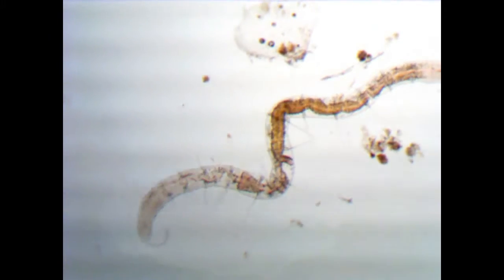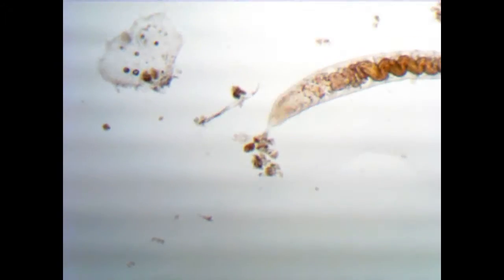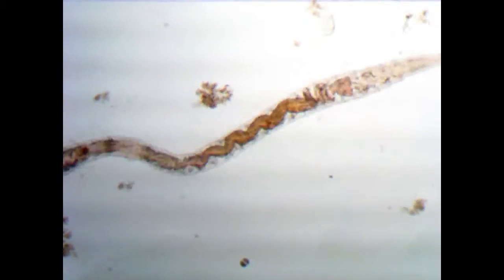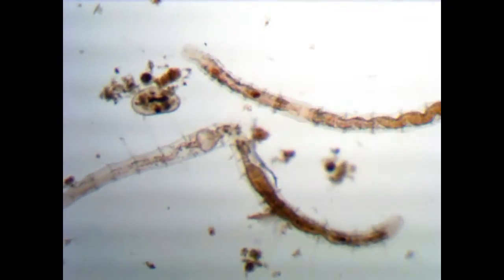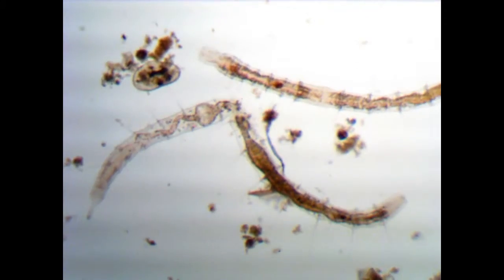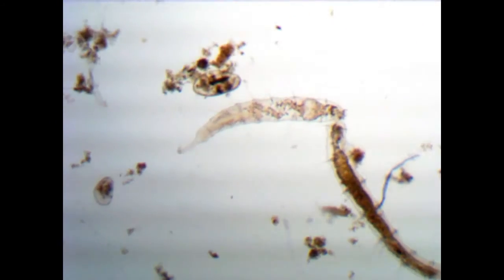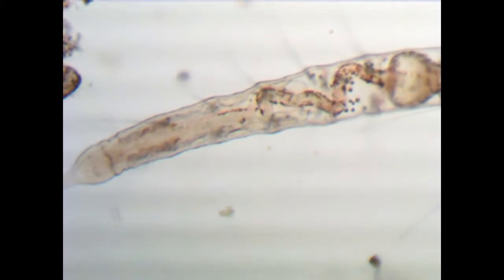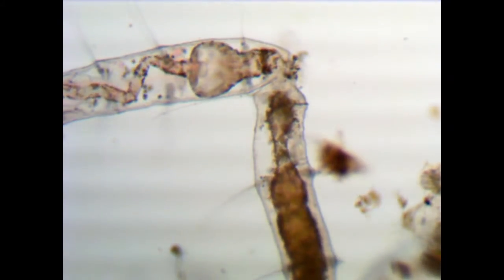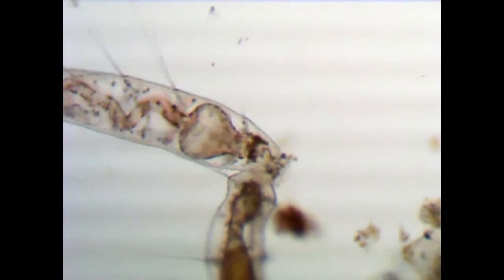So this organism is different from the previous organism for two main reasons. The first one being the hairs that it has, setae is what they're called. These hairs are very much longer. The second reason being they have this weird proboscis nose. Anyways, I came across this, I believe I've injured this organism here. Sorry about that. But because it's injured, it's not moving, which makes it a much easier target for my microscope. So it has a digestive tract, and it's certainly undulating like the last one, which I believe is also in this video. The first worm is not like this.